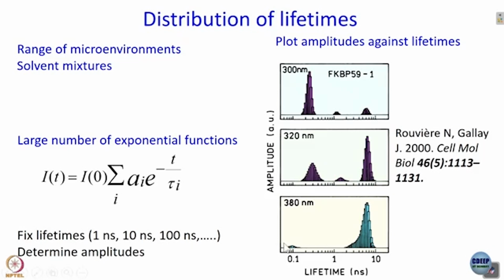So, the 0.1 nanosecond component is gone, you get a 0.3 nanosecond component and you have this distribution there. We have something new between 1 and 2 nanosecond, and that also has a broad distribution, and whatever you had earlier is there. But now it appears that this thick edge that you had has given way to a completely new distribution. Okay. I do not know what the system is, and at the moment I do not care. I am just trying to show you some data, and trying to discuss what this data would mean.